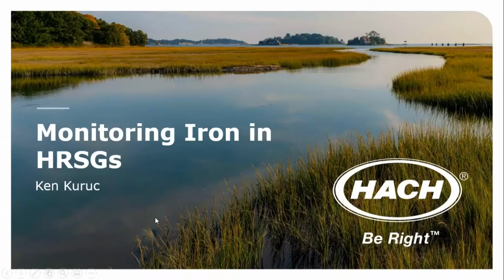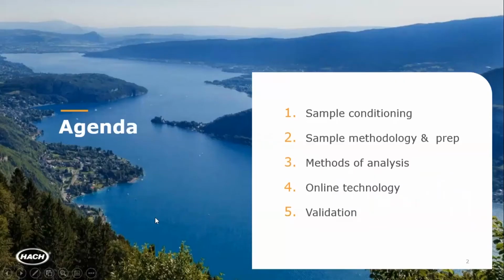What I'm going to be focusing on today is iron and some of the pitfalls, some of the challenges, and certainly the importance of monitoring iron and corrosion product transport. I'm going to talk about sample conditioning and some sample methodology. You're going to see a lot here that has to do with grab sample.